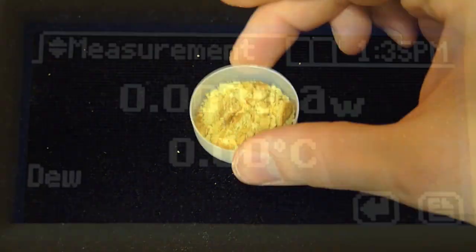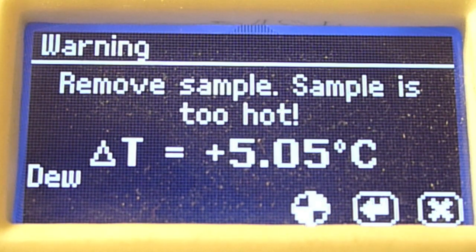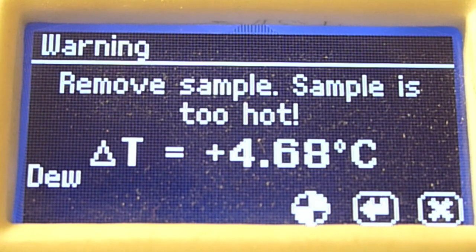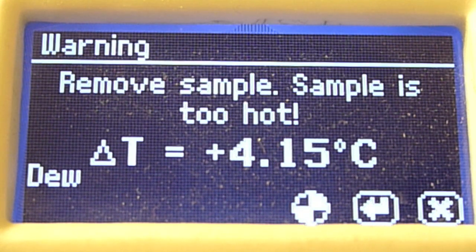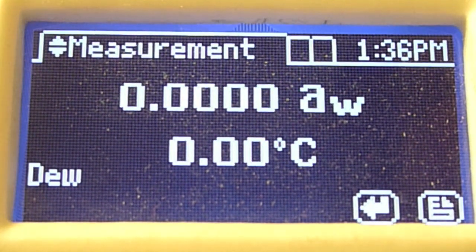If you prepare a sample and put it into the Series 4 while it's still hot, you're likely to see a warning message. This indicates that the sample temperature and the block temperature are too different, which makes it difficult to get a water activity reading. To avoid the risk of condensing water on the cooler block chamber from the hotter sample, remove your sample from the instrument, put a lid on it, and wait a little while for it to equilibrate closer to the block temperature.